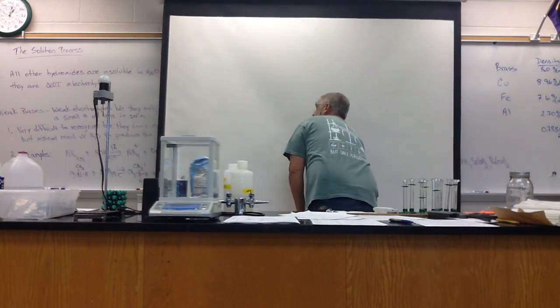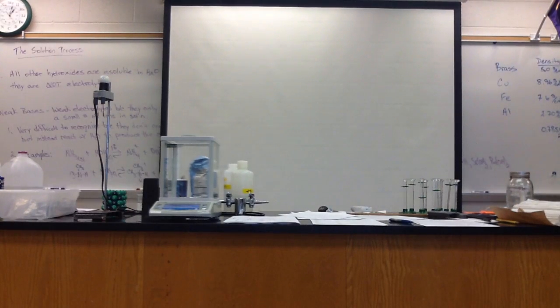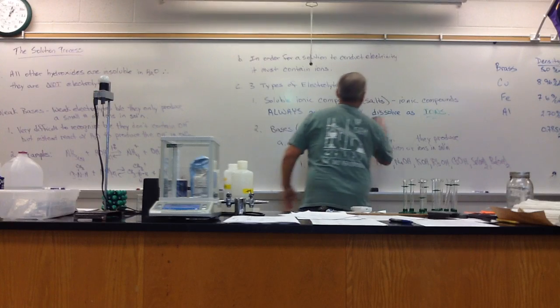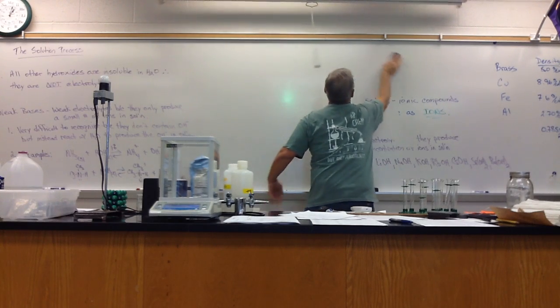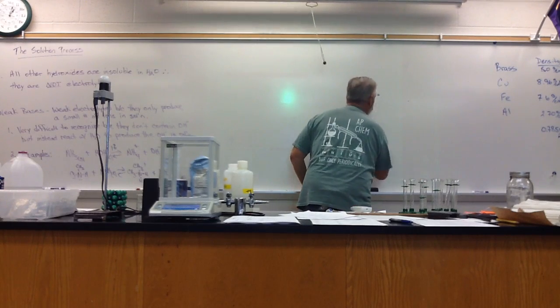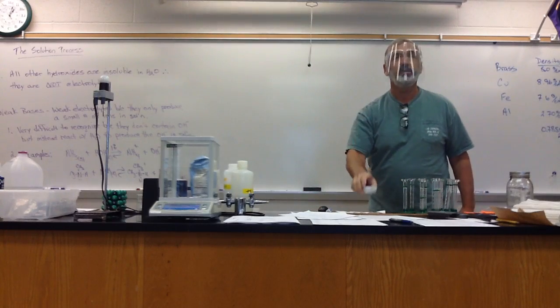you all have the ruler. And I'm actually probably going to have to, this is turned on. Because one of the things that we're trying to learn in this lab is how to accurately and correctly measure with our measuring devices.